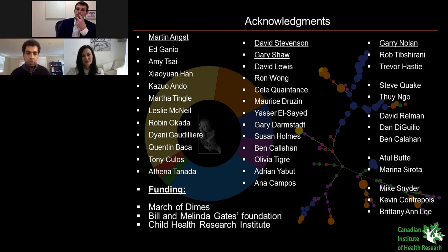But for cytometry, accounting for missing values is a little bit more nuanced because, for example, if you're looking at the median of a specific signaling pathway in a cell type, and a patient happens to not have any cells in that cell type, what do you do with the median? Do you set it to 0? Do you use a predictive algorithm to interpolate the missing value? That's another more nuanced thing to think about when trying to integrate mass cytometry with other omics data sets.